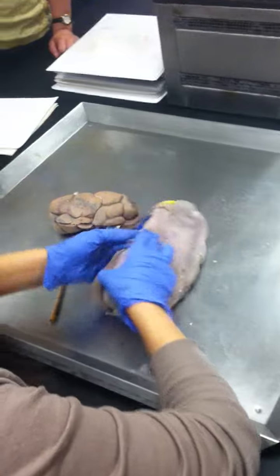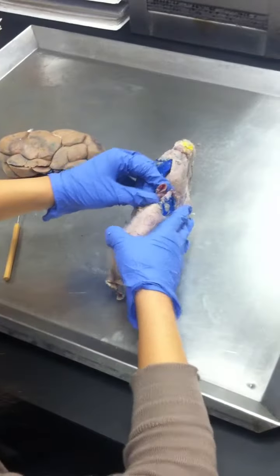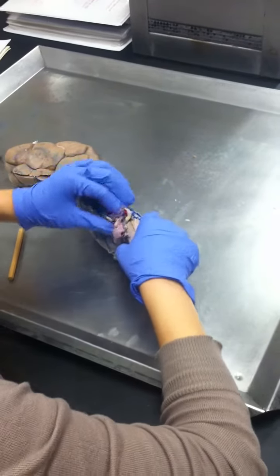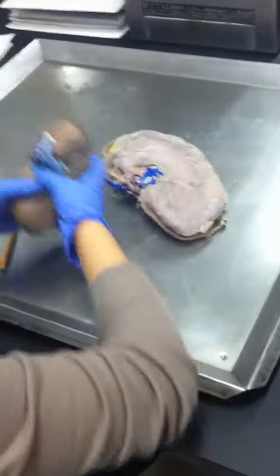So let's see if I can see. Well, there's an artery here, right? The blood vessels, the arteries of the kidneys, are called what? Renal arteries. And then the veins would be the renal veins, right? And then we also have what coming out of the sinus? The ureter, right? So we could see if we could find the ureter in one of these.